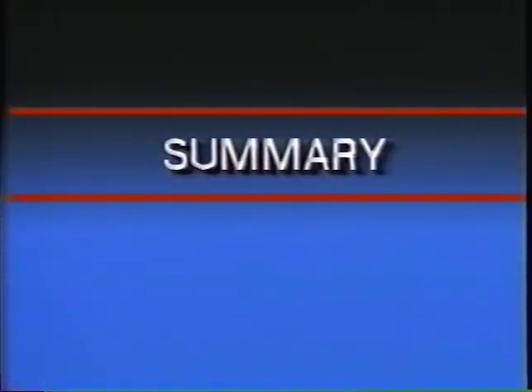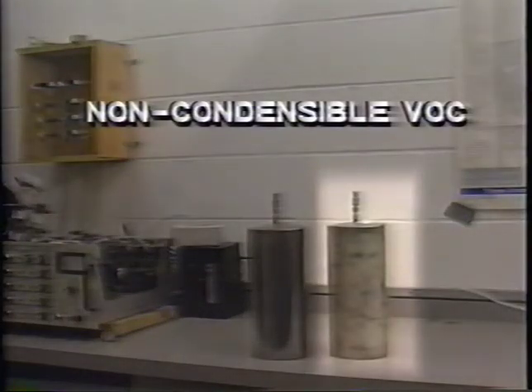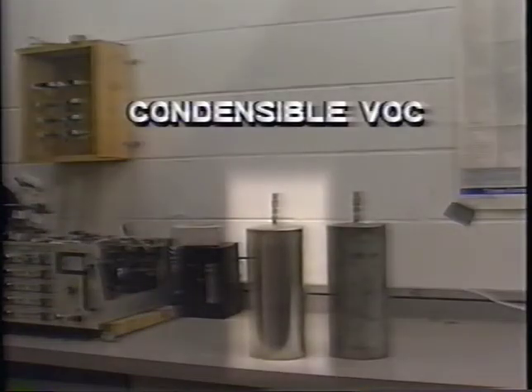In summary, the tester now has 2 sample tanks to analyze for VOC. The sample in the first tank, collected at the test site, contains non-condensable VOC. The sample in the second tank represents the condensable VOC, which have been converted to CO2.